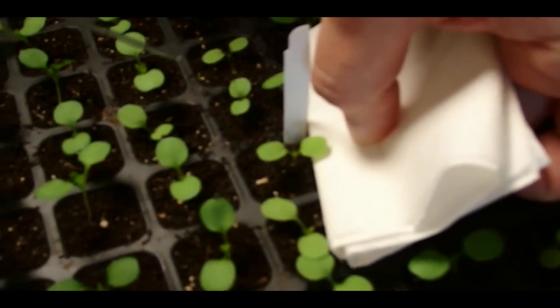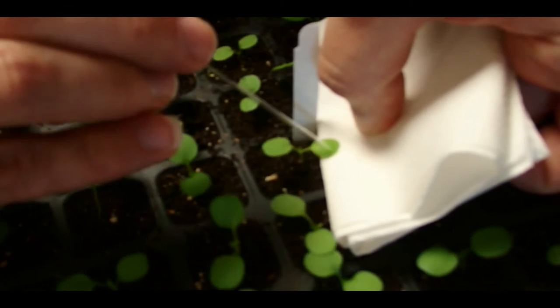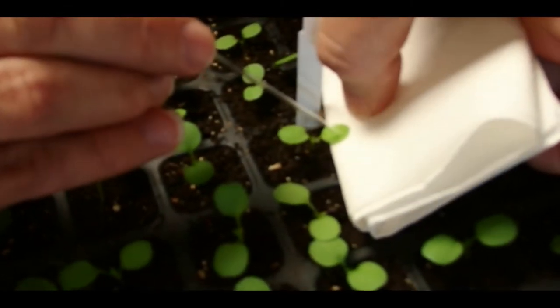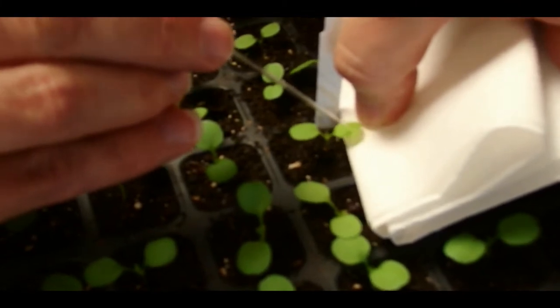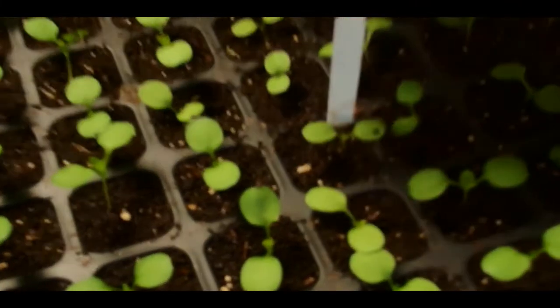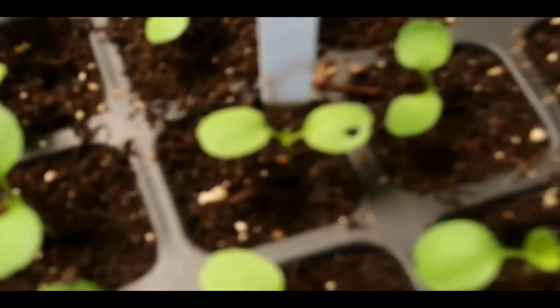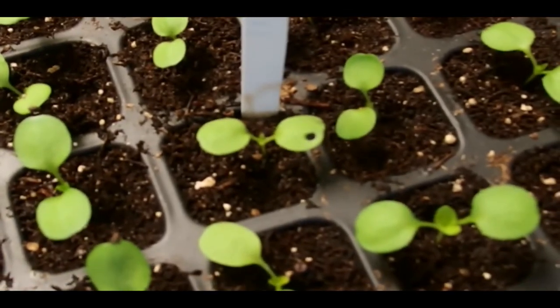Yeah, go ahead. She puts the paper towel behind there and puts the capillary in. You do a twisting motion, is that right? Mm-hmm. Yeah. Okay, and now you'll see there's a little hole. I'm going to try to get in close so my camera will focus. Doesn't want to focus perfectly, but there's a little hole on the plant.